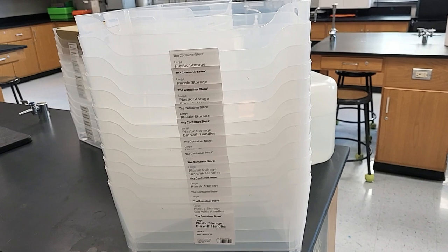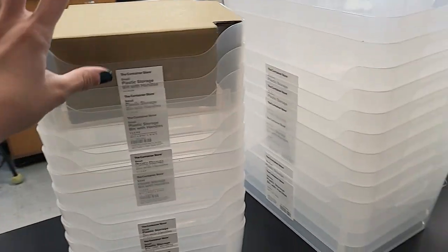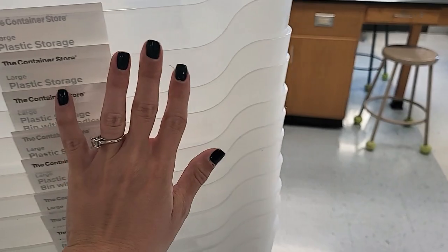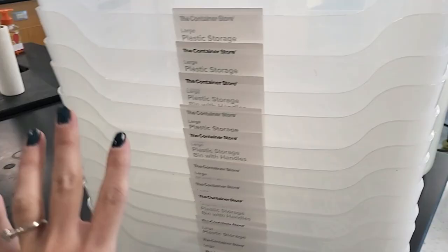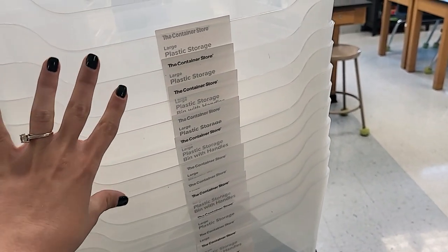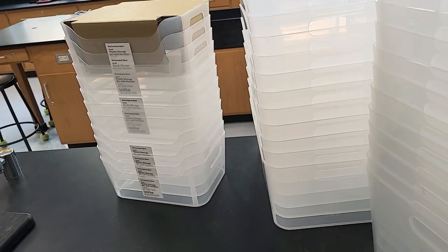I purchased 3 different sizes of bins from the container store. I got these little bins, the medium size bins, and these large bins. These bins fit very nicely into my cabinets. The goal of these bins is for me to get organized and organize all the equipment that I'm using for each individual lab.